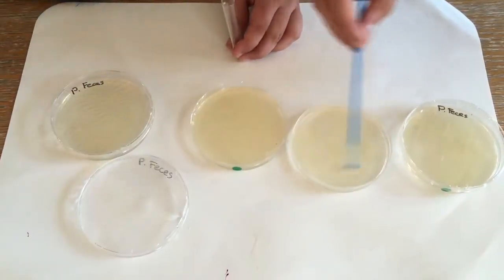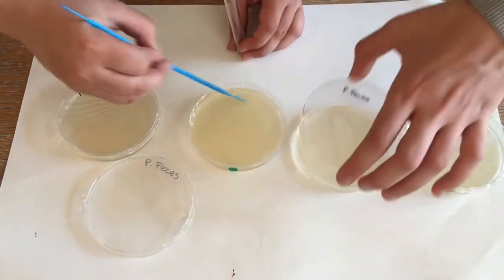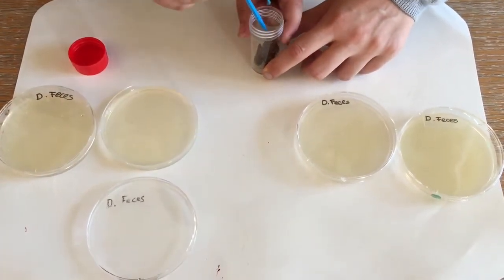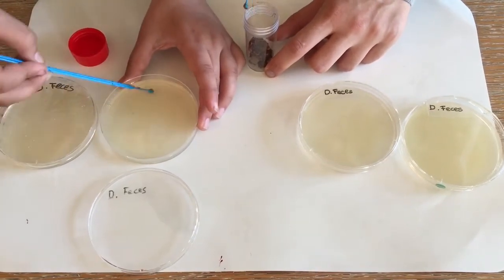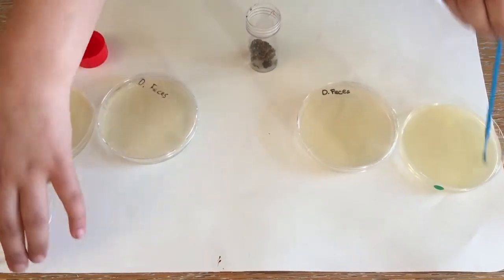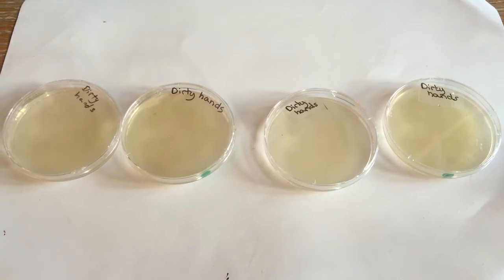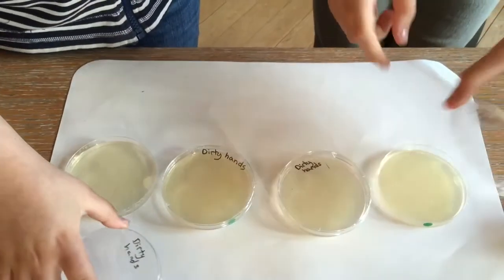Hopefully this will be the most colonized bacteria. Now we're going to do it with dog feces — it doesn't smell really good. Now we're going to do the experiment with our fingers to see the bacteria which come from our hands, and we'll do smiley faces.